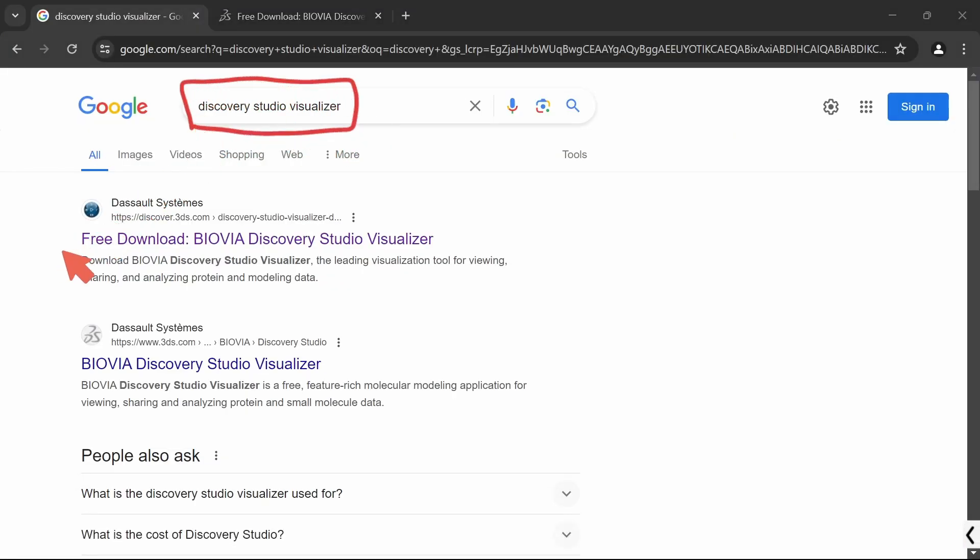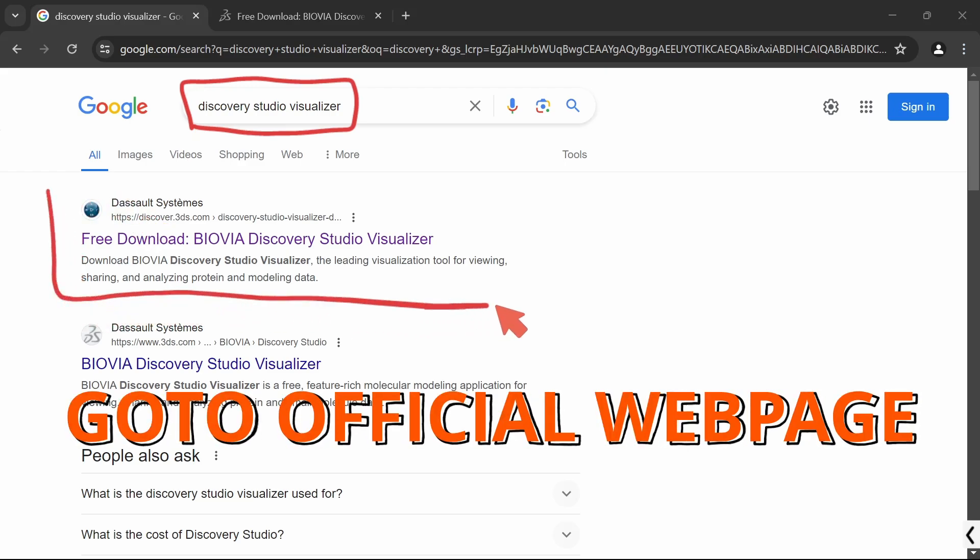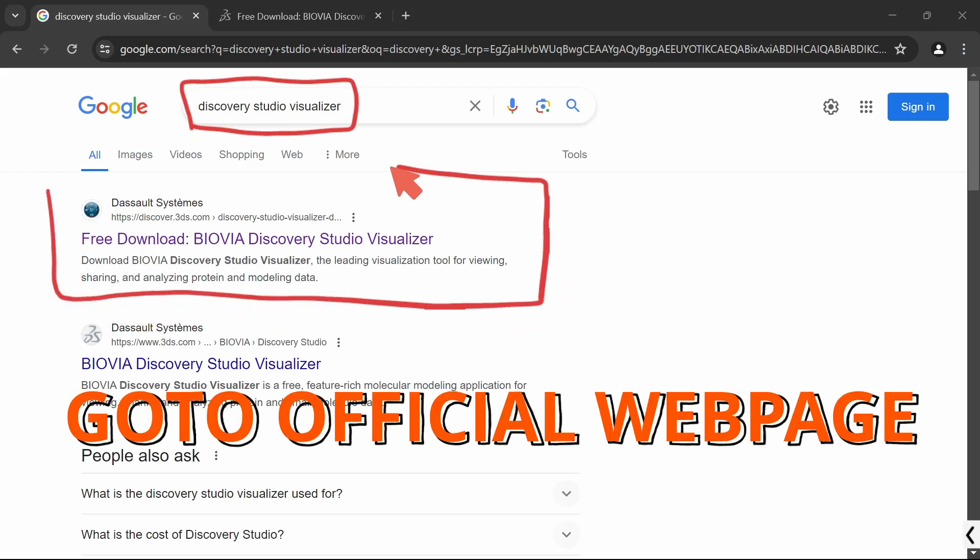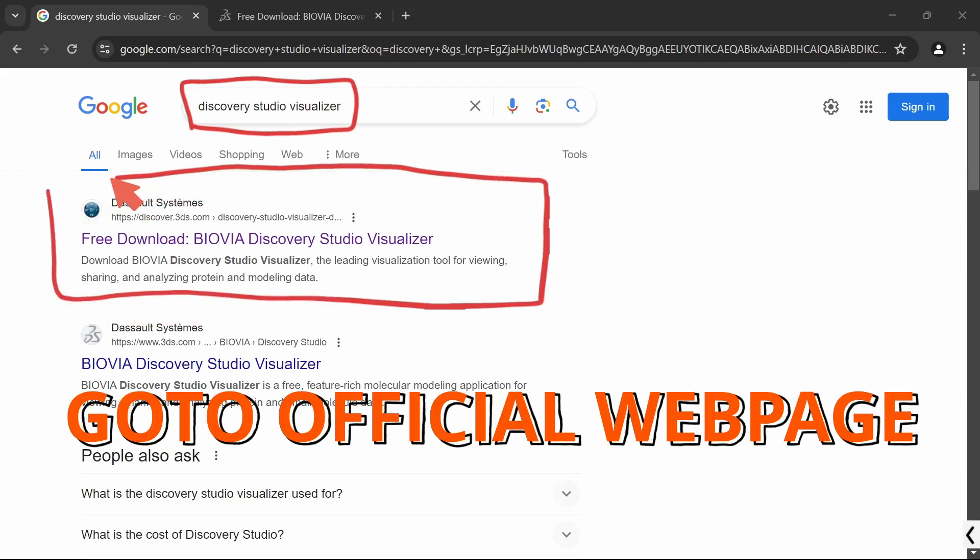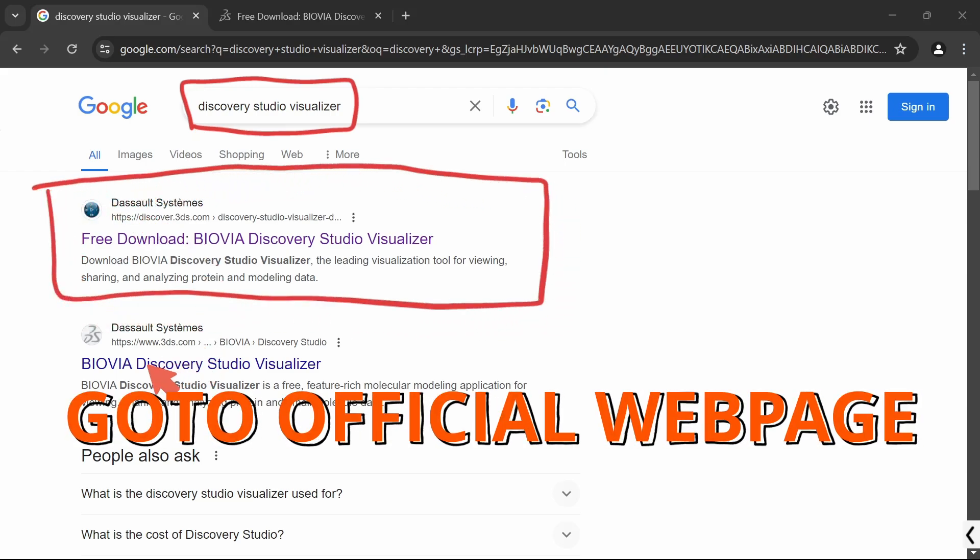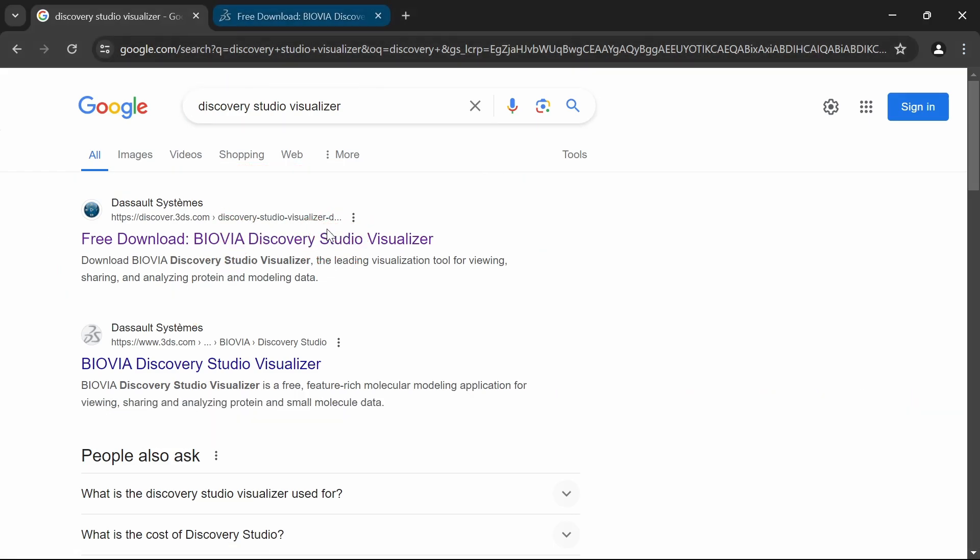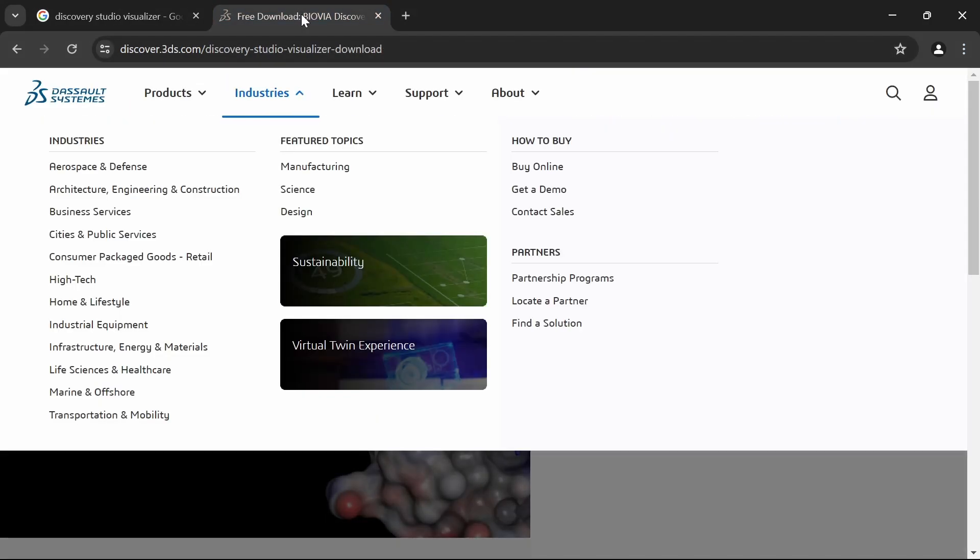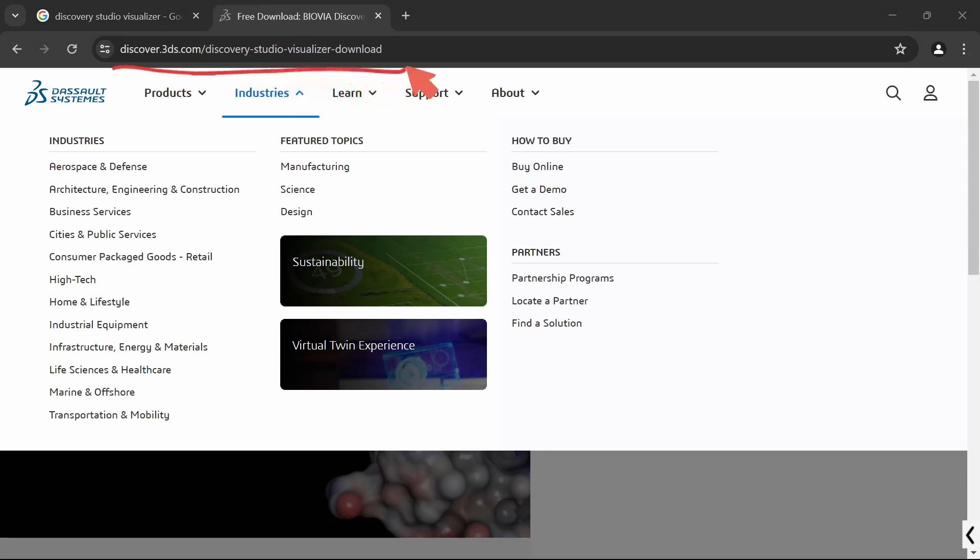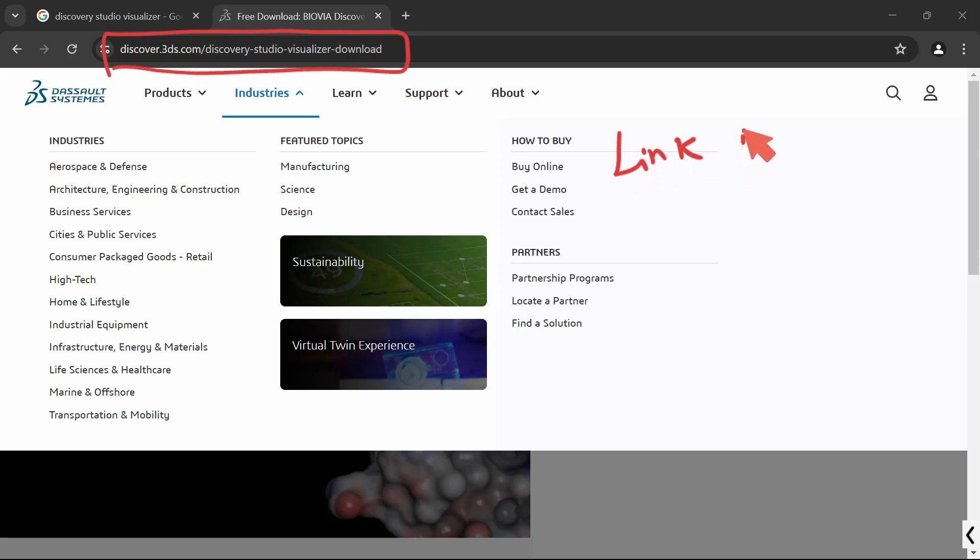Open your browser and search for Discovery Studio Visualizer. Click on this link, free download Biovia Discovery Studio Visualizer. This will take you to the official website discover.3ds.com/Discovery-Studio-Visualizer-Download.